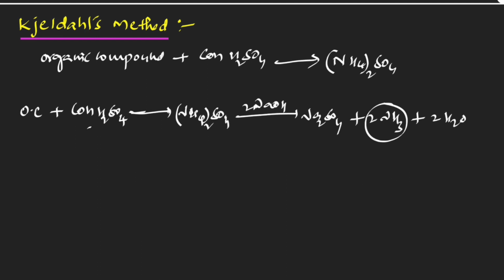See, ammonia with H2SO4 solution, it gives ammonium sulfate.